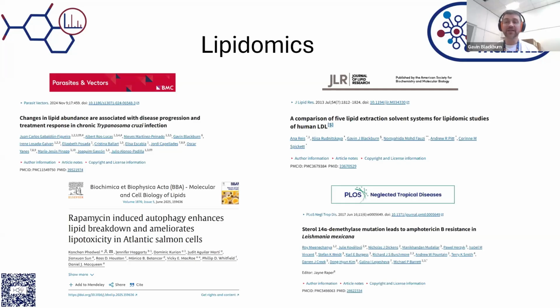It's a really nice example of how these different things overlap, and how having these different technologies and pieces of equipment within the lab allows us to take experiments a little further than just having a single mass spec down which we could run these samples.